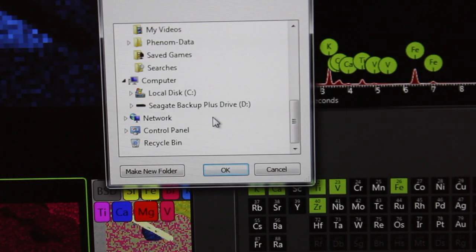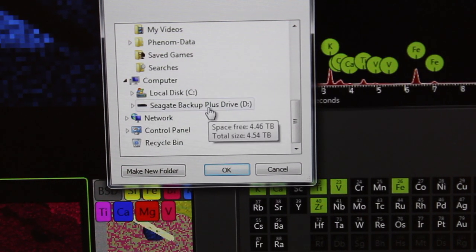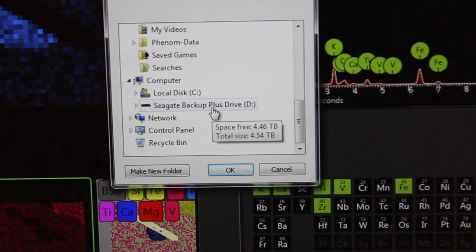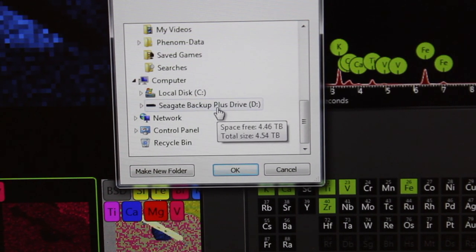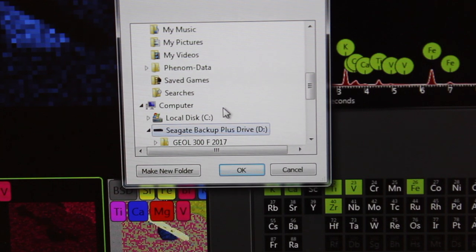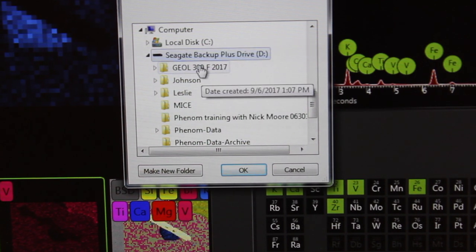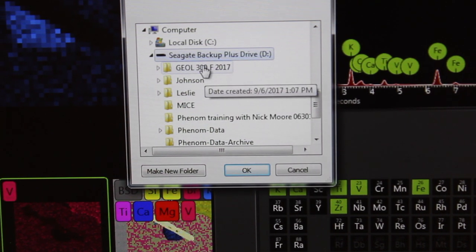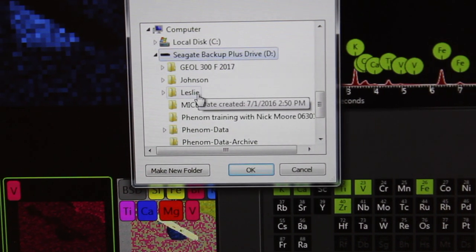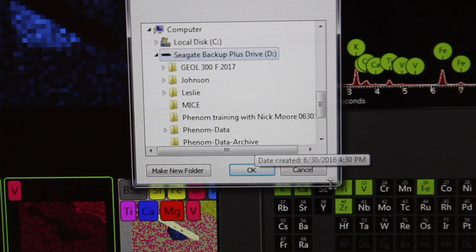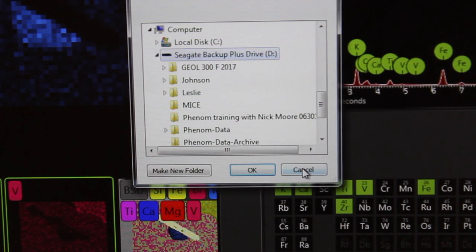In this case, we will save our data on the Seagate backup drive here. We have folders here, and you can make your own folder and save it in there.